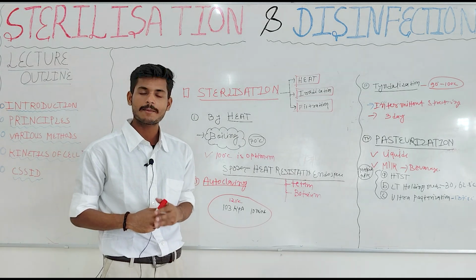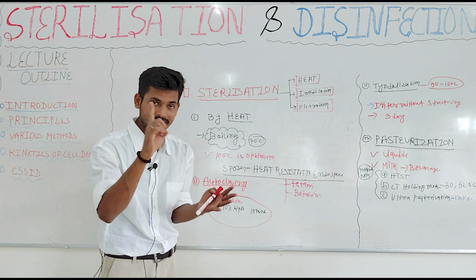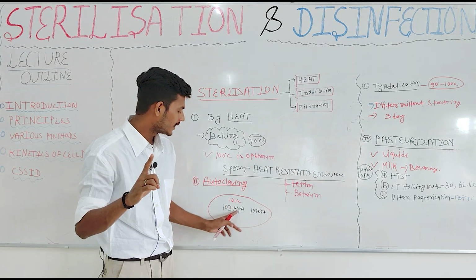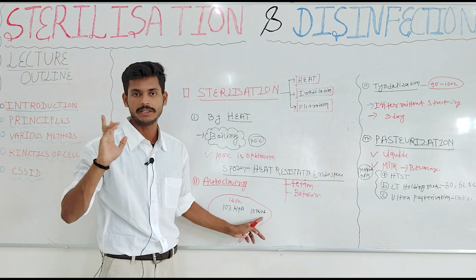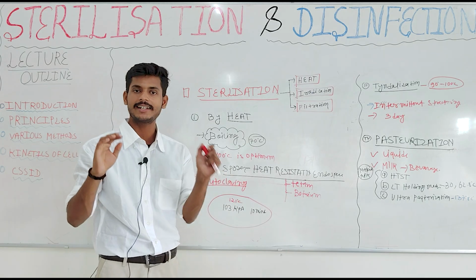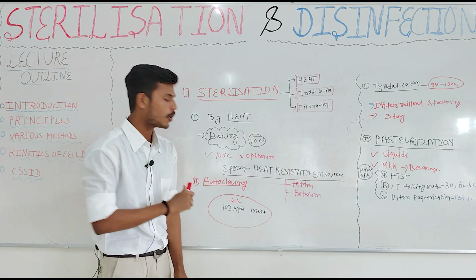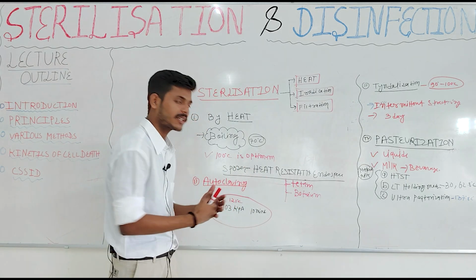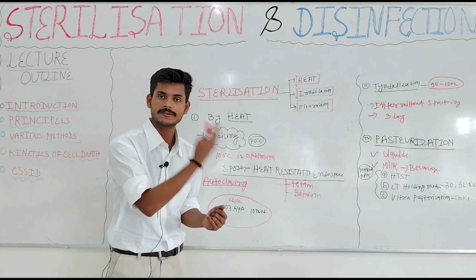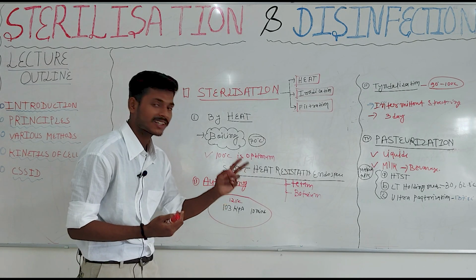Now, in autoclaving, what is happening? We are heating the objects in a closed vessel at 121 degrees temperature under 103 kilopascal pressure for 10 minutes. By this method we can destroy the heat-resistant endospores. But not all medical equipment and products can sustain this much temperature. They lose their texture and shape, and foods lose their nutritional value. So we have to search for another alternate technique.